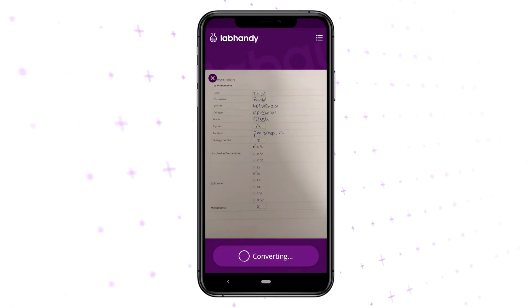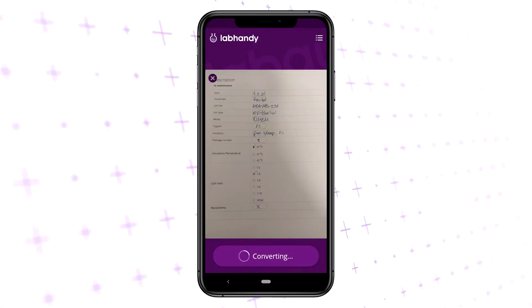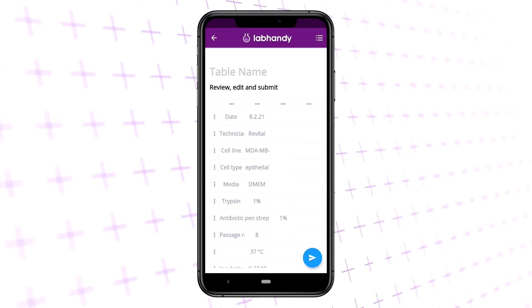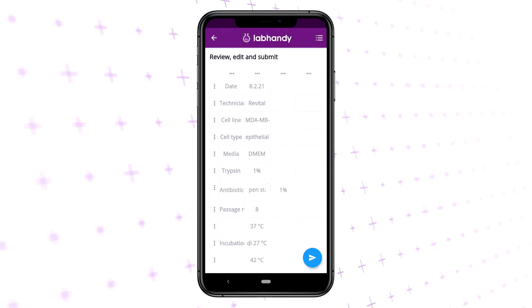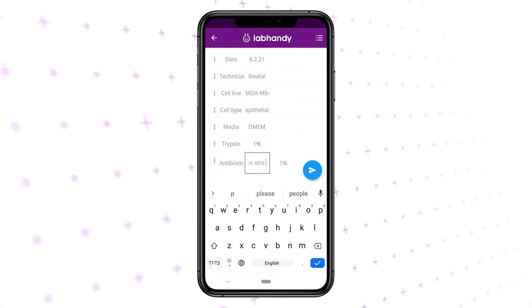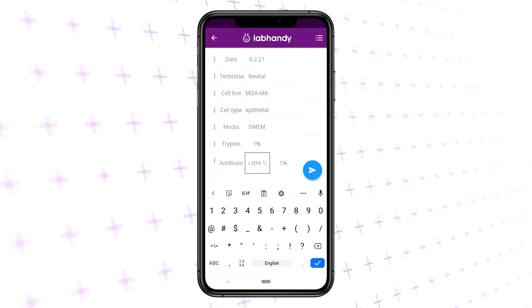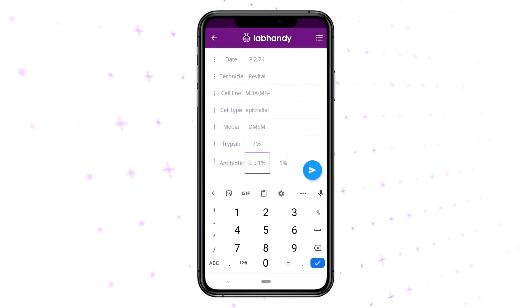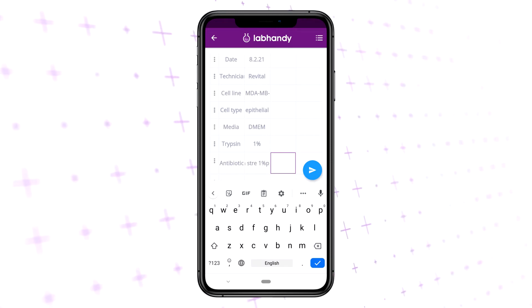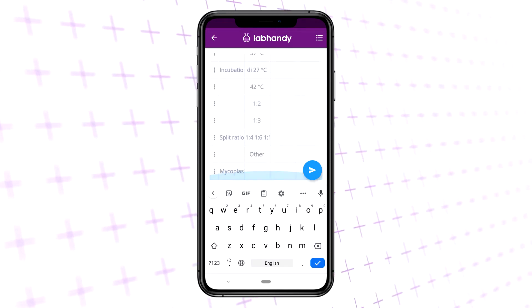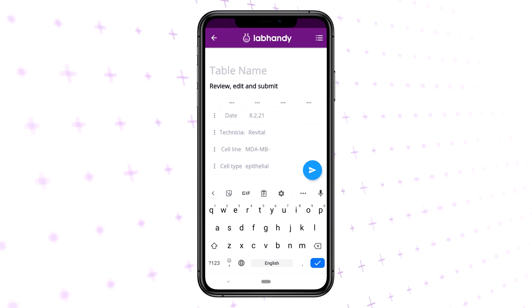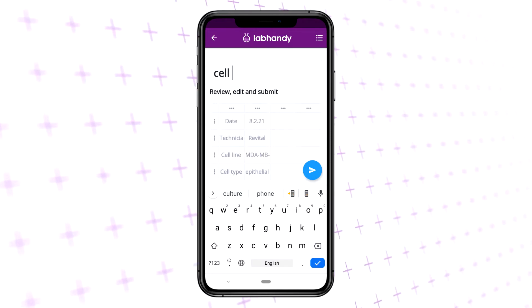The table will convert into an electronic layout. You can edit the table name and review the entries. You can make changes in the fields once entered, then review and save.